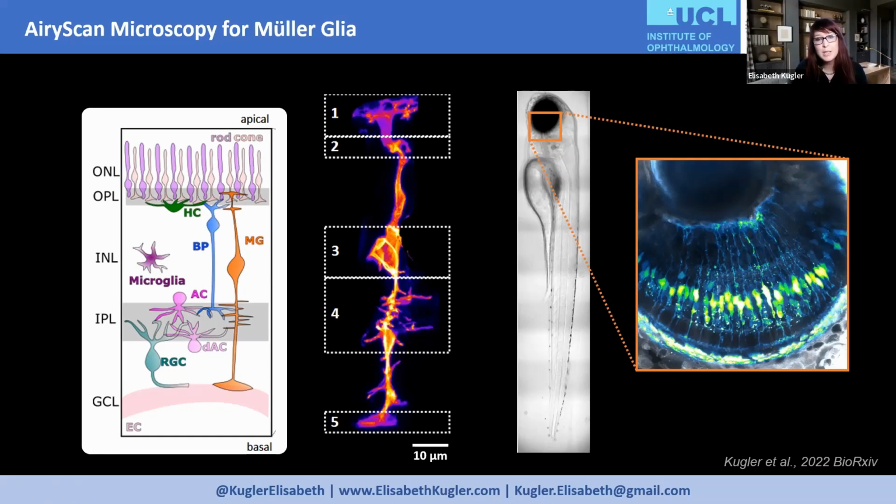In disease, you would see an alteration of how the cell nucleus looks, but also how their interactions with certain cells are changed. So we use their shape as a readout for their functionality. This is really where we need this morphology analysis to say what they are doing and how healthy they are, etc. As a model, we are using zebrafish, and we mainly use transgenic lines. This means that we have genetically changed the fish so they express certain fluorescent proteins that allow us to visualize these different cells of interest.